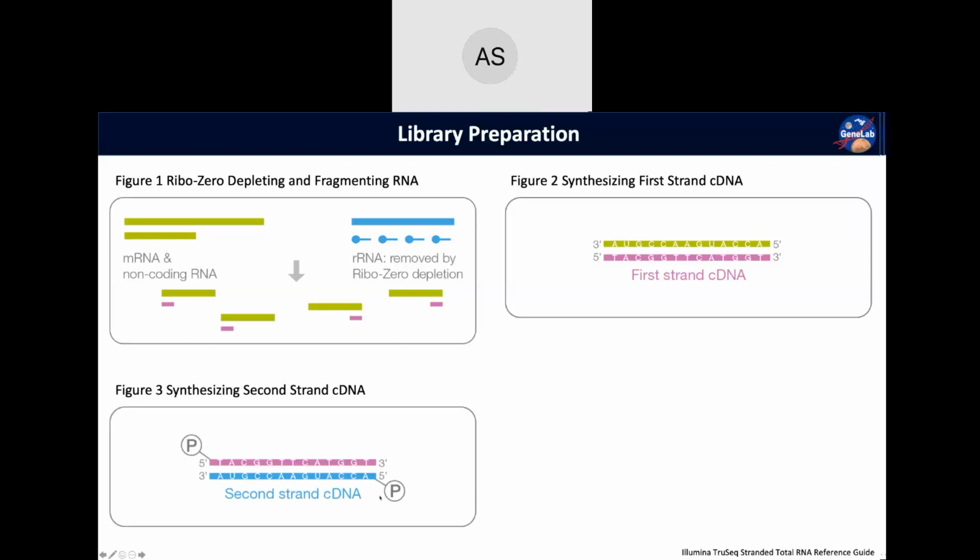And Illumina kits are trying to make their DNA stranded, so that way when we're doing our sequencing, we're always sequencing the same strand. Because remember, this comes from double-stranded, so this helps control and regulate when we go and do our quantification if we're always looking at the same strand.